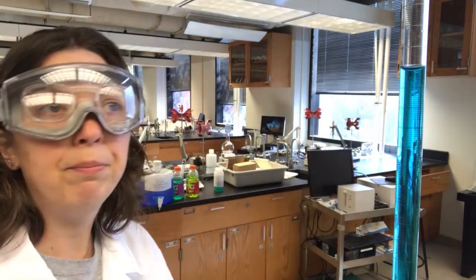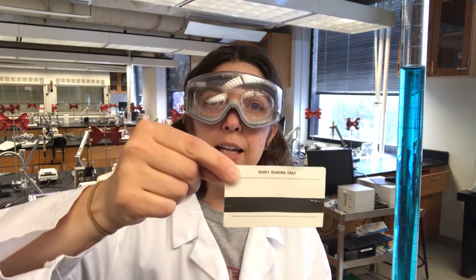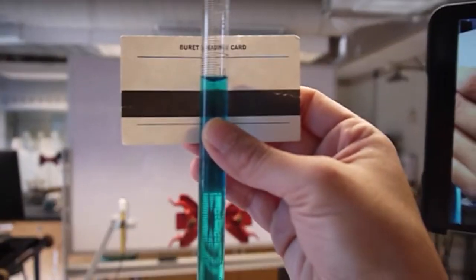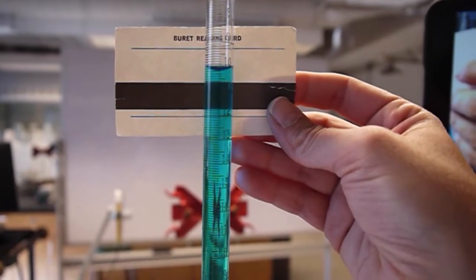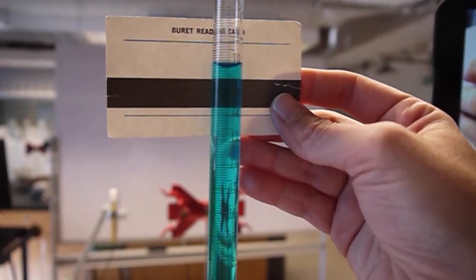Now, in your drawer, you've got these really handy burette reading cards right there. It's basically just a business card with a dark line on it. That dark line is going to highlight the meniscus of the solution for you and allow you to get a really nice measurement. Very simple tool, but it's really helpful. So let's see if I can focus on this. There we go. Okay, so here's no burette reading card, and here's with the burette reading card. You see how that darkens up that meniscus? Just reflecting there. And that really allows you to take a good reading on that burette.